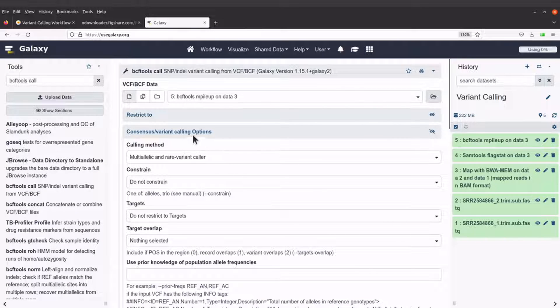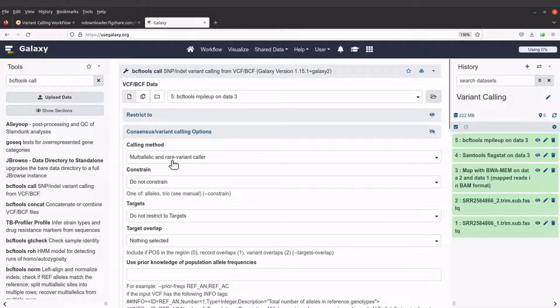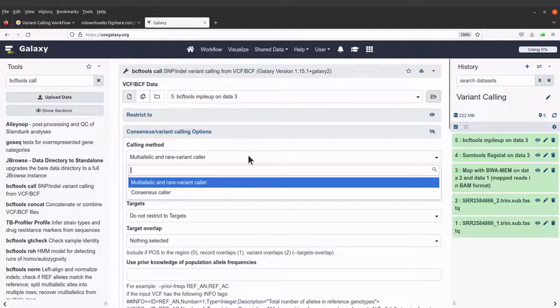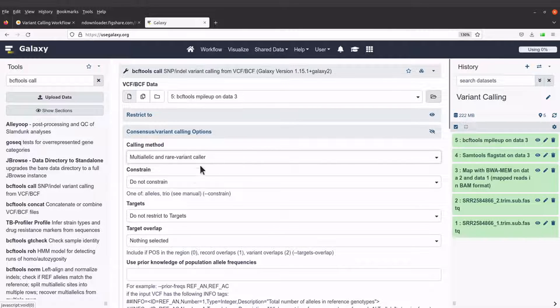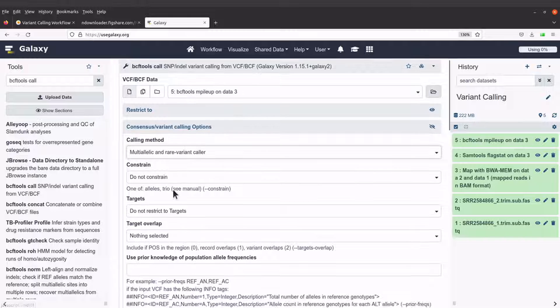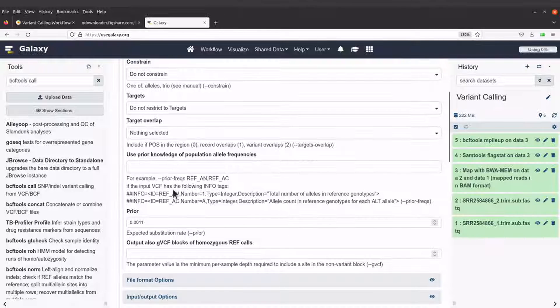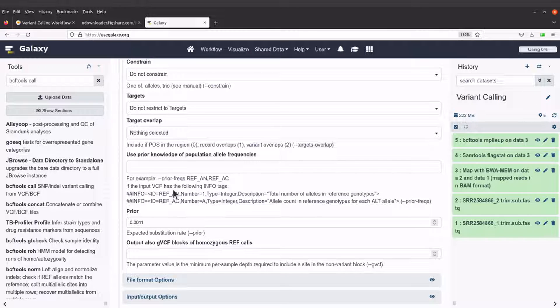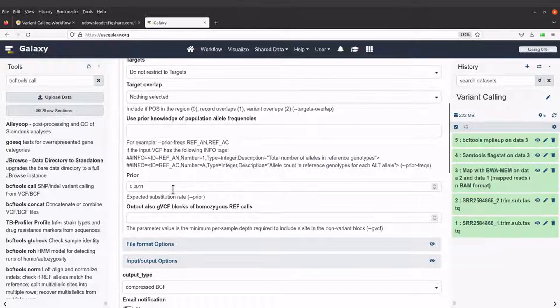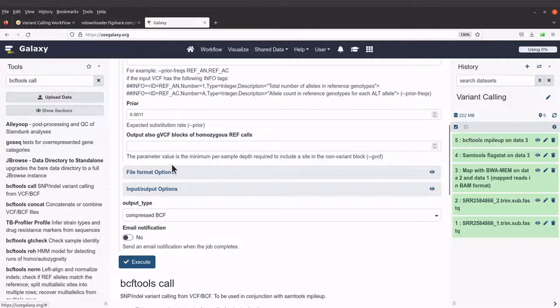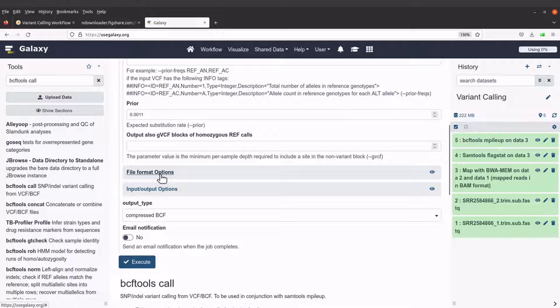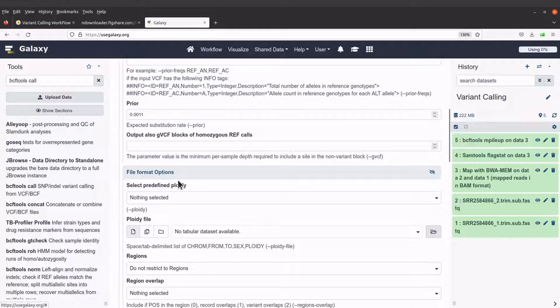For the consensus/variant calling options, we will use multi-allelic and rare variant caller. Then let's scroll down and come to file format options.